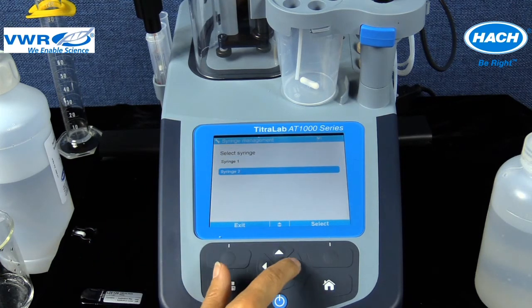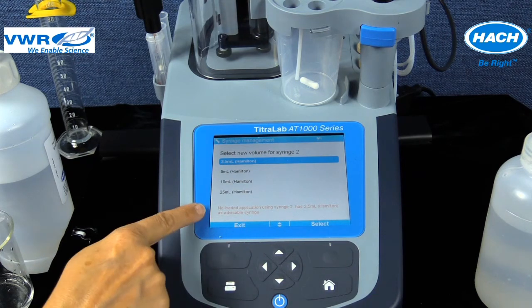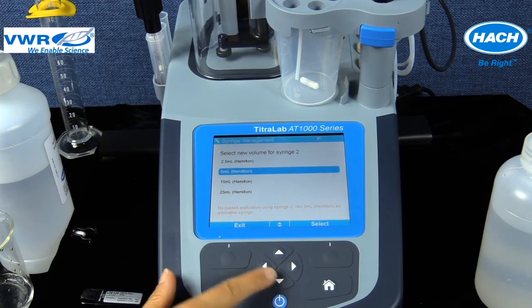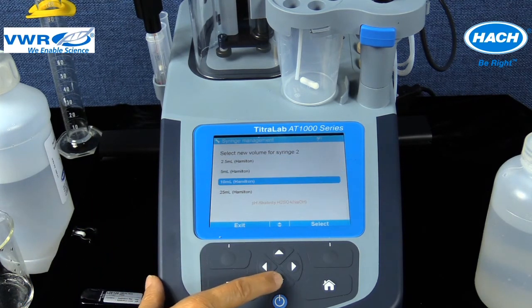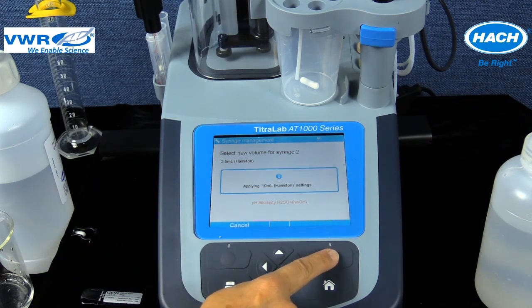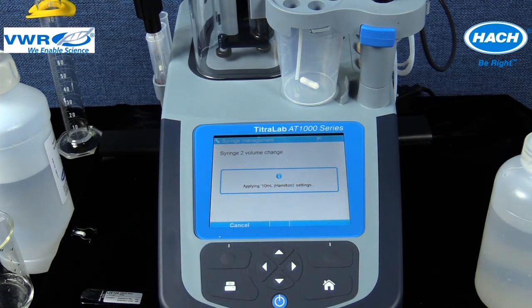The software provides notes in red text that help match the application and correct syringe usage. When the 10 mL syringe is highlighted, the software provides a message in red that confirms the application currently loaded matches that size syringe. The software will then apply the syringe volume change, the volume will be updated, and OK can then be selected.